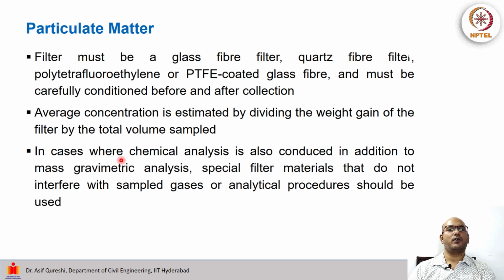In cases where we also want to do chemical analysis in addition to the gravimetric mass analysis, we need to use special filter materials that do not interfere with the sampled gases, and the analytical procedure should be adopted suitably.